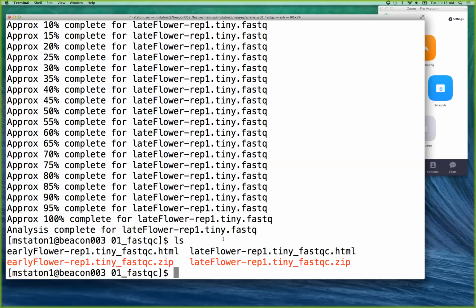So when I start working with sequencing data, I always keep a concept in mind: garbage in will be garbage out. So before we do the real analysis with the sequence data, we want to make sure that the sequences are cleaned up and the low quality sequences are removed. To achieve this goal, we're going to use Skewer to do the trimming.